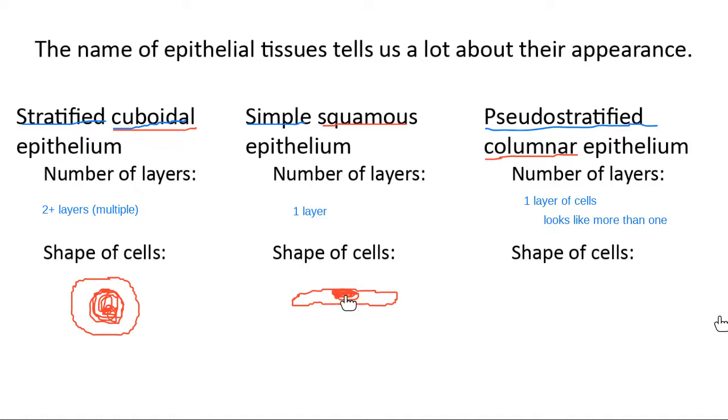The middle part is going to be where we find the nucleus. If you looked at simple squamous epithelium from the top down, which I don't think we have any slides that show this, but I'll just mention that a simple squamous cell from the top down kind of looks like a fried egg. So if we were looking at it from the top, this is what it would look like. It's really wide and expansive, weirdly shaped with the nucleus in the middle. Most of our squamous cells that we see are flat. They're squished. So we see those from the side.